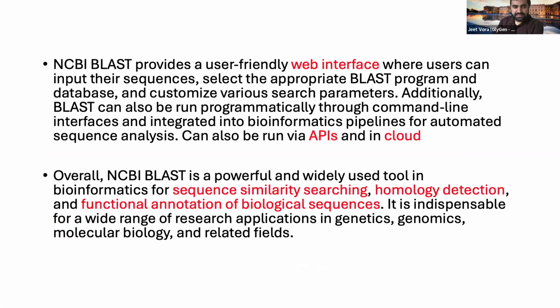So how you can access BLAST using their web interface. They have a well-developed interface with tons of features, and it's intuitive. It takes, I would say, a few tries to get everything in place and in order, and you can run your BLAST. Also, if you are programmatically savvy, you can run it via APIs, and they also have a BLAST implementation in the cloud, which you can make use of in your research or analysis.